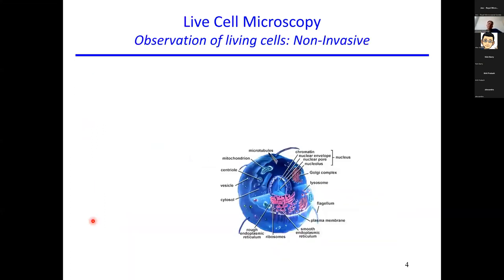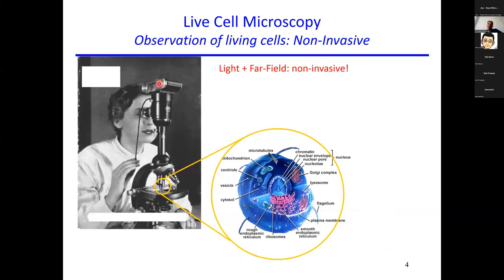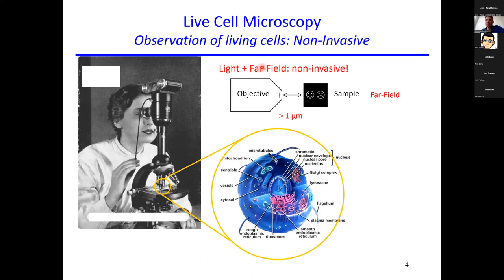And when we use microscopes, we have to observe a living cell. So we have to be non-invasive, because while we observe it, we don't want to change anything. And a good way of doing this is with minimal invasion. I'm not saying it's completely non-invasive, but it's minimally invasive: it's light. We are surrounded by light. And also going into the far field. Far field means we work with focused light. When we work with focused light and lenses, everybody knows we create a focus. And the focus is usually micrometers, millimeters, centimeters away from a lens. That's why we don't touch the sample. And we can go inside the material. We can go inside an organism. We can go inside the cell. And so that's called the far field.